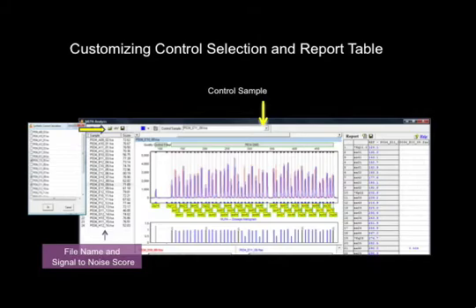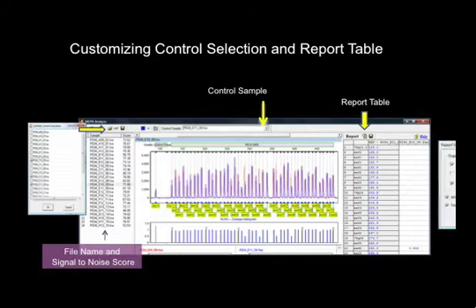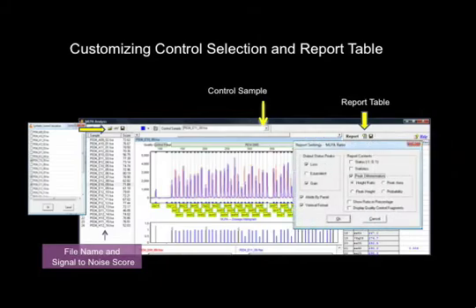The report table lists the probes, reference samples, size of each fragment, and the experimental samples. The report table may be customized using the report icon.